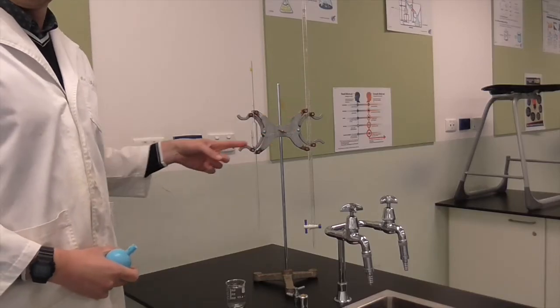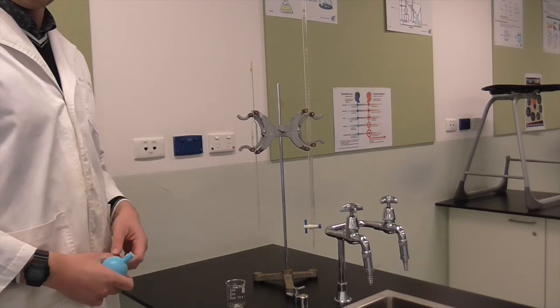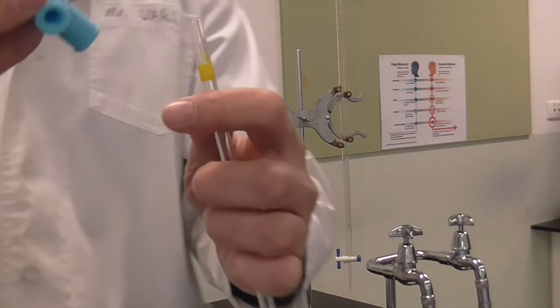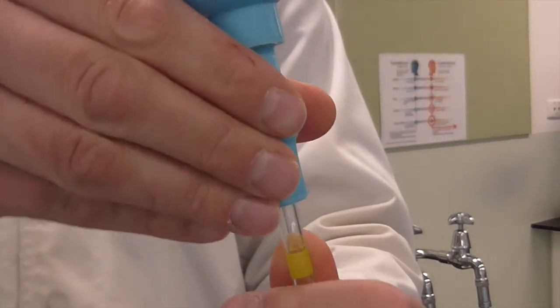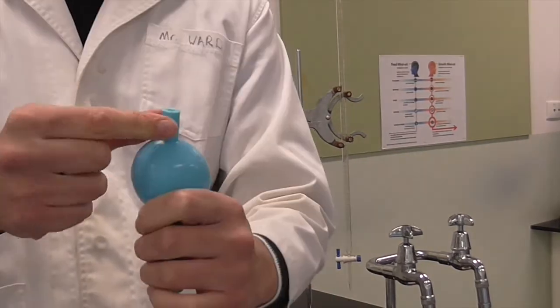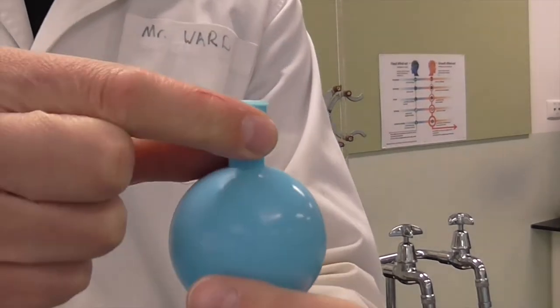We're going to go through rinsing the burette and the pipette. We're going to start with the pipette. Remove the pipette from the burette clamp. Place the pipette filler on top. Be very careful when you do this so you don't hurt yourself. Evacuate the pipette by squeezing the top valve and emptying out the bulb.